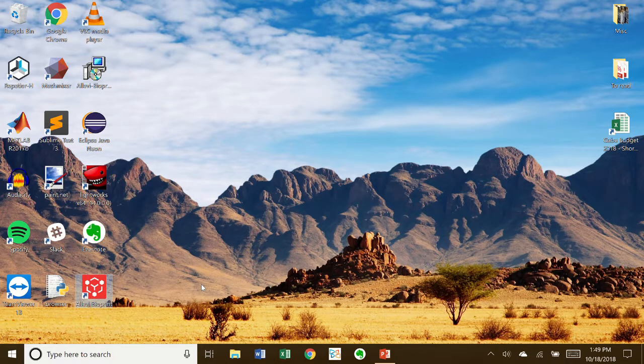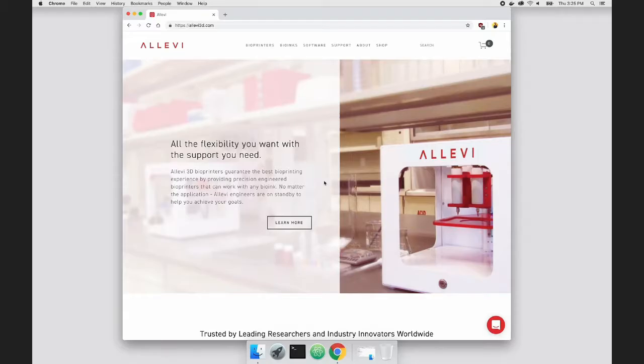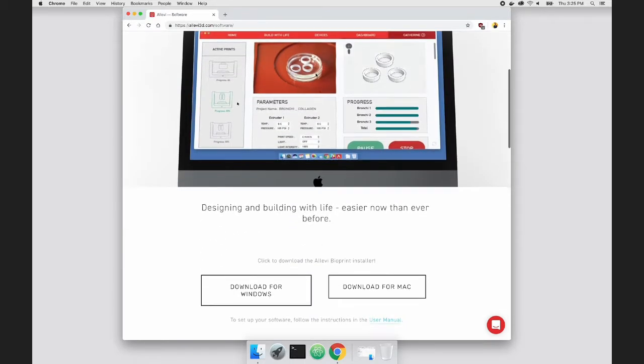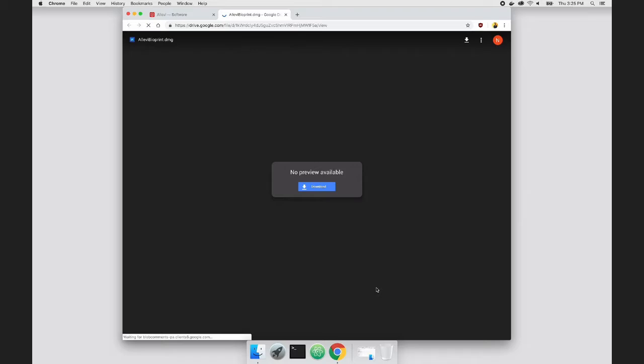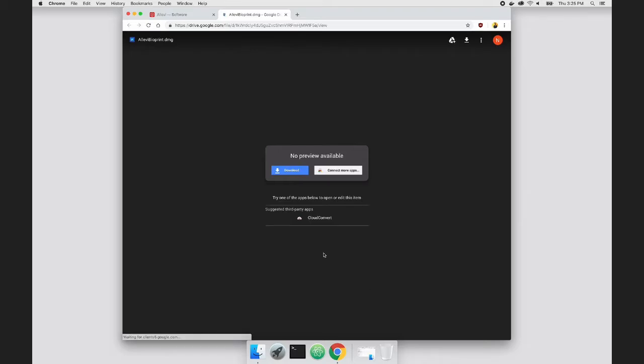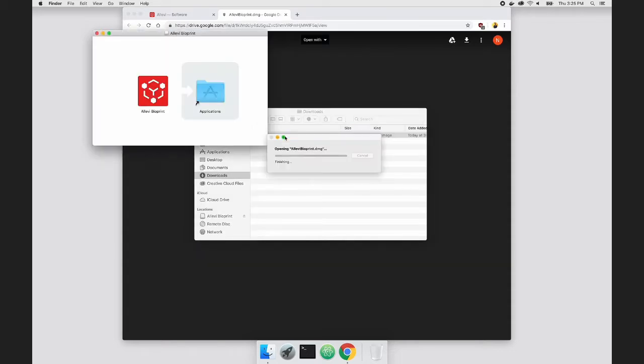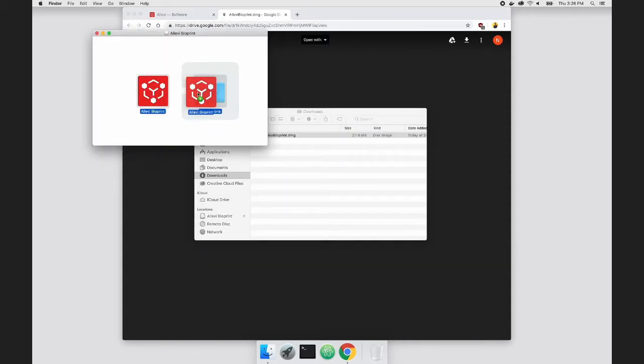You can always start again from the desktop app. For MacBooks, go to the software page and download the Mac installer from your Google Drive link. Open your download and click the file. Move Allevi Blueprint to Applications.